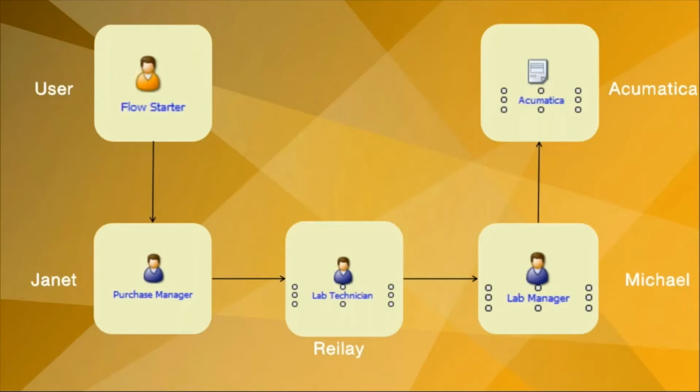Finally, after granting all the approval needed, the form will go back to the creator and get saved automatically in eBA. Now let's get started with the demo.